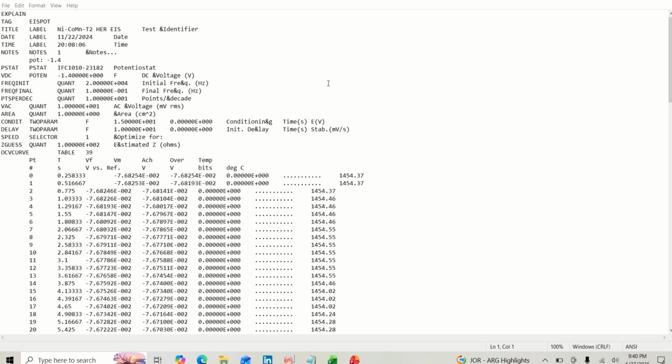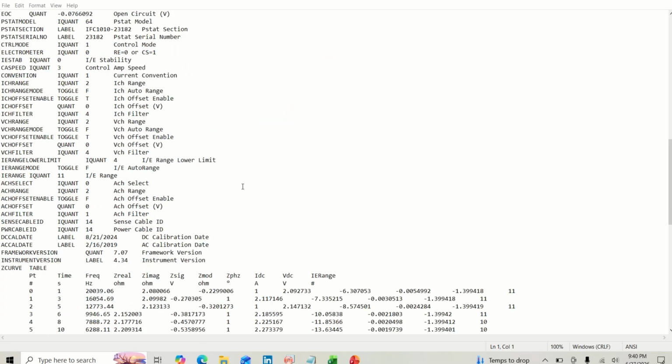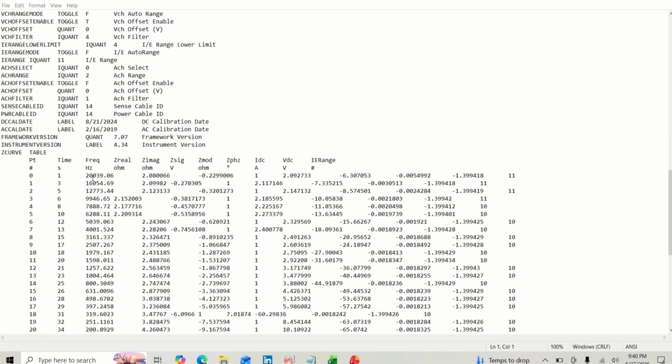Today we are plotting EIS data, that is the Electrochemical Impedance Spectroscopy. It is basically like taking an AC scan of your electrode. We apply a small AC voltage at different frequencies and measure how the system resists that signal. This resistance is called impedance. We therefore run EIS on both HER and OER for water splitting to understand how good an electrocatalyst is.